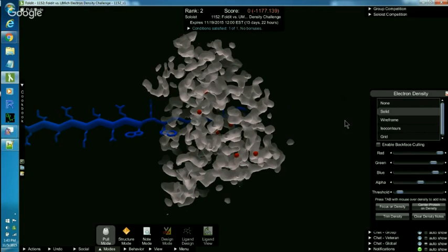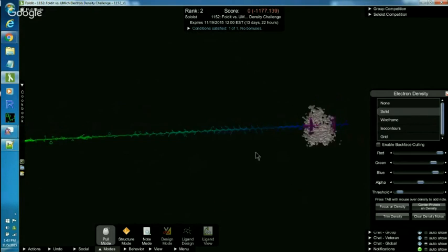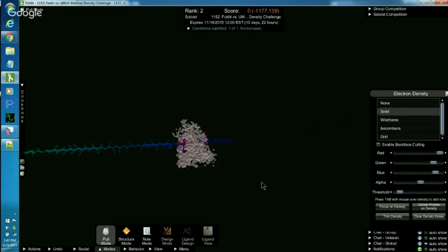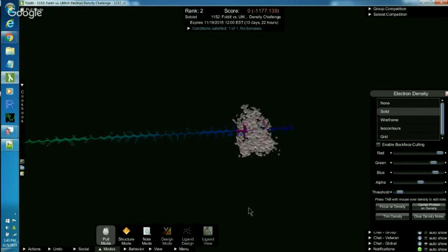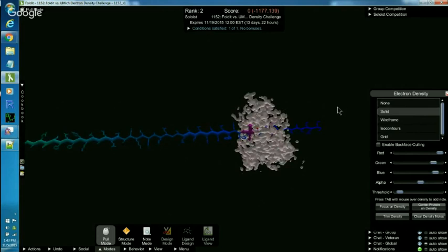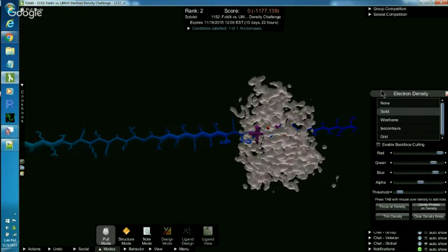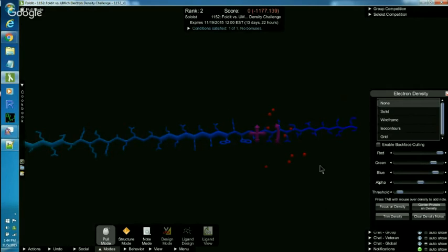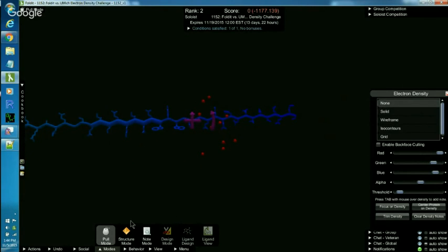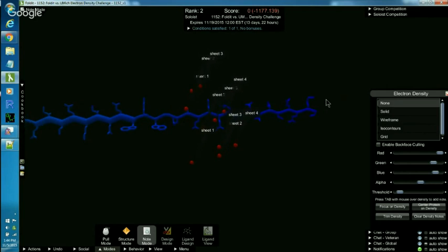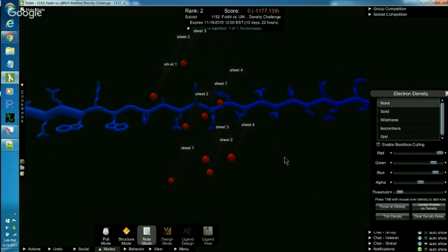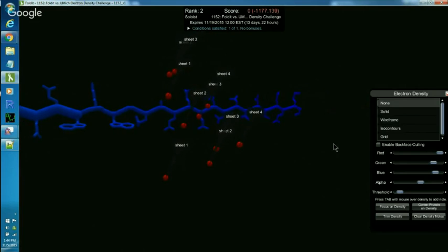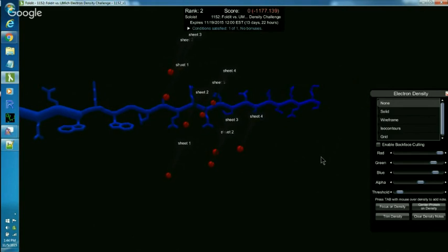I'm going to zoom out. So I've got all my foreground and background back. And when I'm ready to actually put the protein sheets into the cloud sheets, I'm going to turn off the cloud. I've got all my dots visible. And I can go into modes and note mode. And it will turn on all of my notes. And I'll be able to see which dots go to sheet one, which dots go to sheet two.